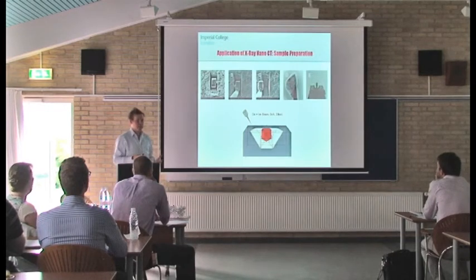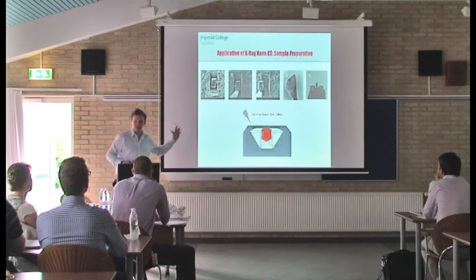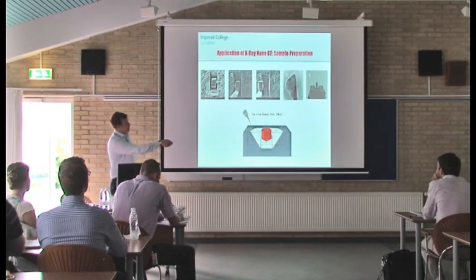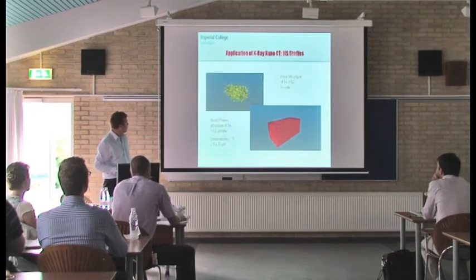So we're then satisfied that we've met this criteria for reducing noise in the algorithm and for giving us some sort of assurance about the contributions from the geometry and the contributions from the phase. And then this nicely sits in the little sample holder, and that's what MD showed.